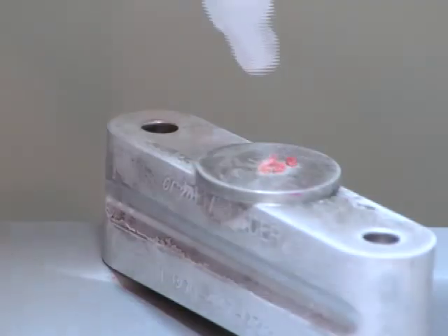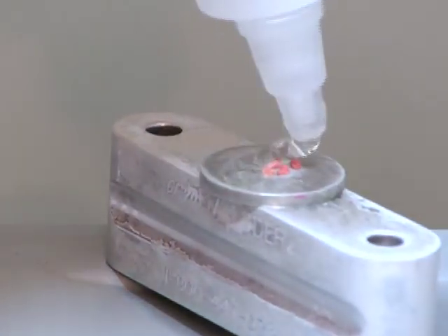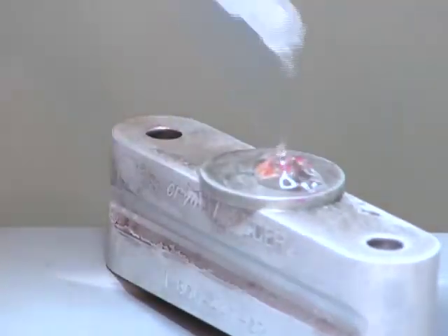This portion of the demonstration has been performed in real time to show the speed at which frozen section samples can be ready to cut.